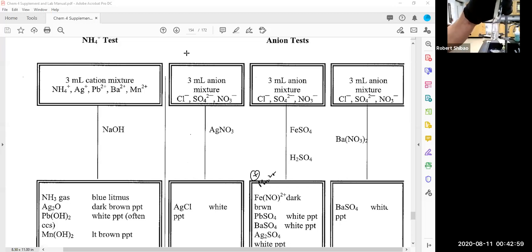It's still kind of slow. This is drip, drip, drip. You can see there's still quite a bit of solution up there. Maybe the angle's not so great. Okay, this isn't finished filtering, but that's enough solution to test. I just need enough to test. And so I'm going to stop it halfway. It's probably filtered about halfway.